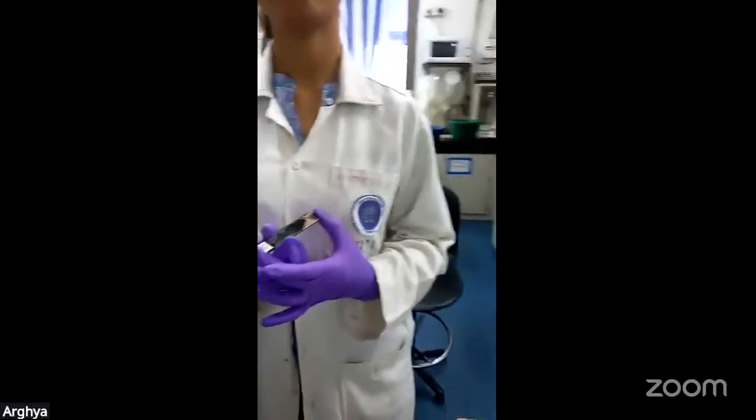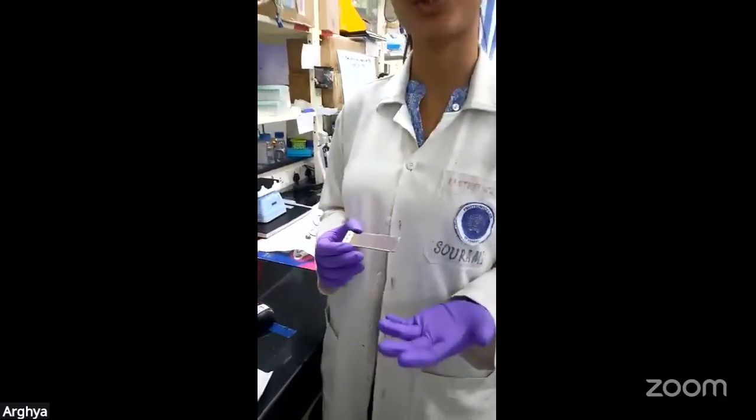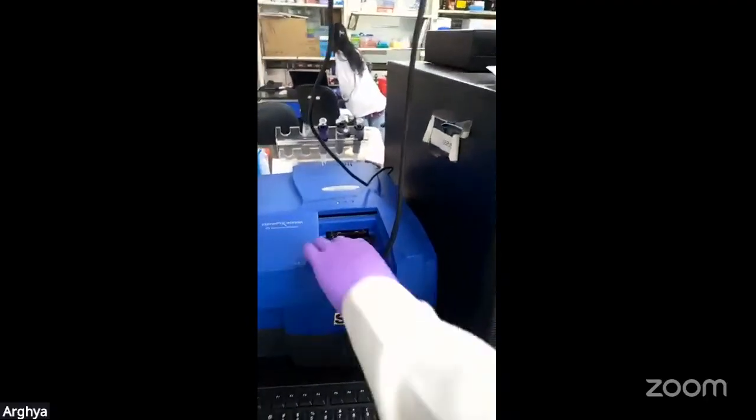There are many applications that we can do using microarray. We can study DNA hybridization. We can study protein interaction. We can study antigen antibody interaction and many more. Now, this is how we insert a chip in the microarray scanner.